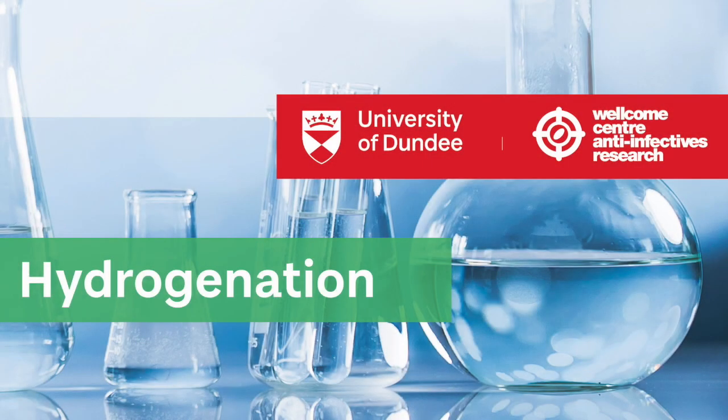We are going to take you through the setup for a hydrogenation reaction using palladium on carbon. We will also show you how to set up the balloon for the hydrogen gas to ensure maximum safety.